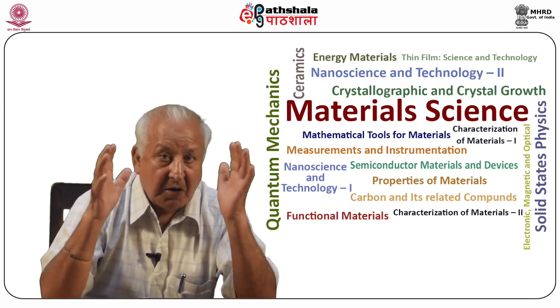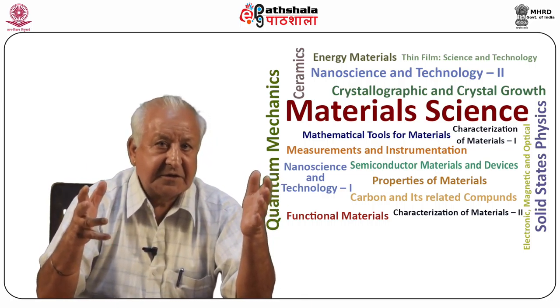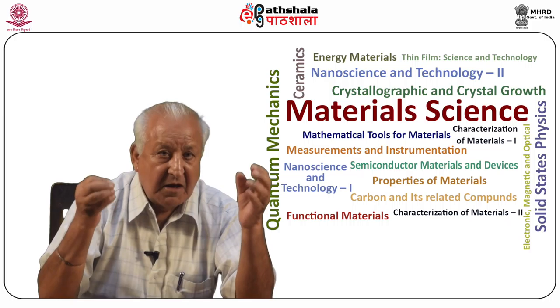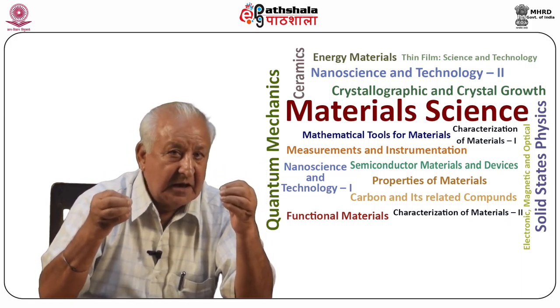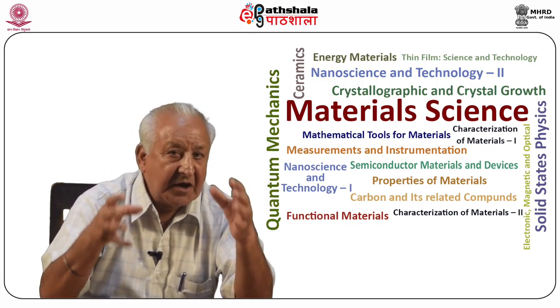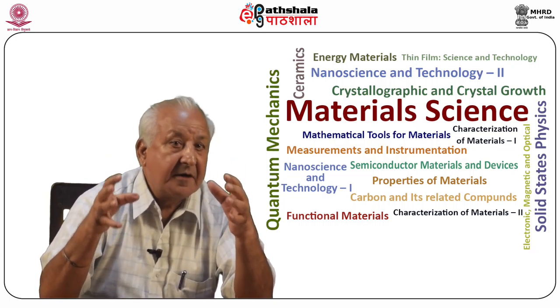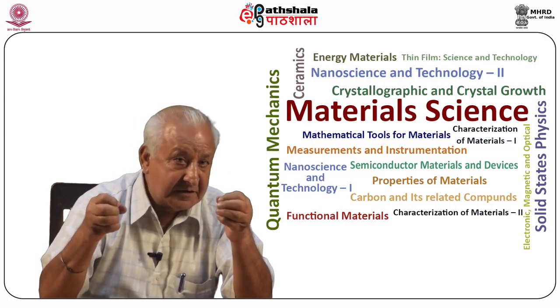Larger apertures are also used for some types of studies. Larger apertures lead to composite patterns from many crystals which form powder rings in case of such a material that is polycrystalline with random orientation. It is known as general area diffraction, and these studies are of interest in texture and preferred orientations in materials like platy minerals such as clays.